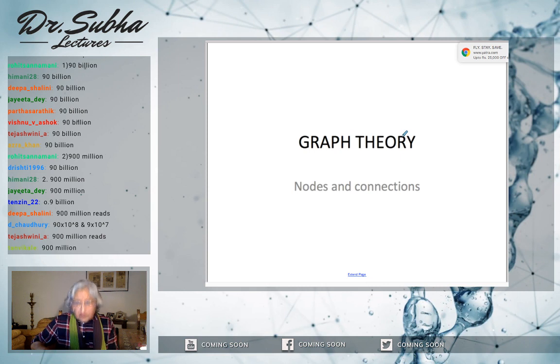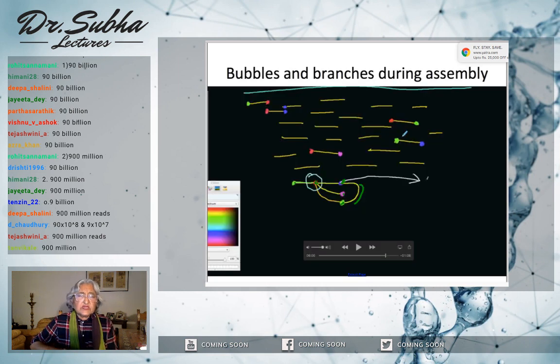One of the simple things I'll tell you, take a 10-mer sequence and blast it against NCBI BLAST. Okay, it won't even give you any result because the score will be so small that it won't give you any result. So you keep extending your query nucleotide sequence, and somewhere close to 25 to 30 or 35, you will start finding hits to the database. And at one point, you will start finding unique hits. And somewhere in 31-mer, it starts finding unique hits. It's unique to a given genome.